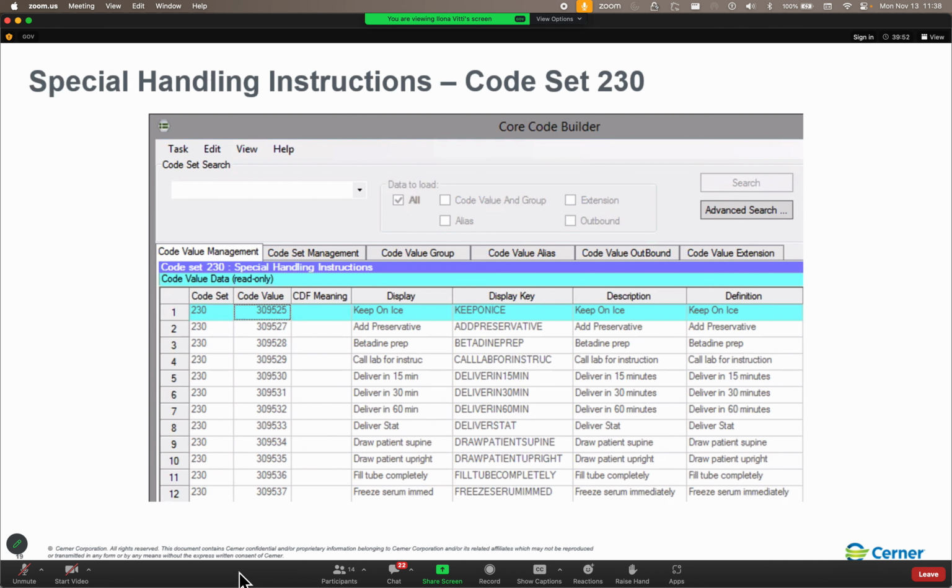So if you're sitting there going, whoa, there's way too much going on in there, you lost me, oh, don't worry, I will be reminding you of this again as we go through. The big thing I want you to go ahead and remember is all of these settings in here, and then look in Bedrock.